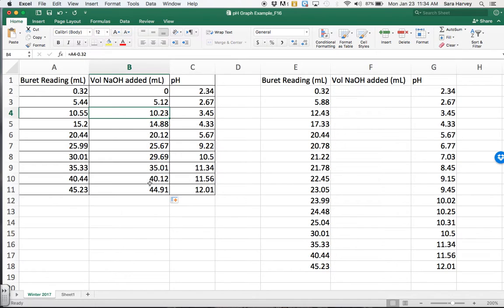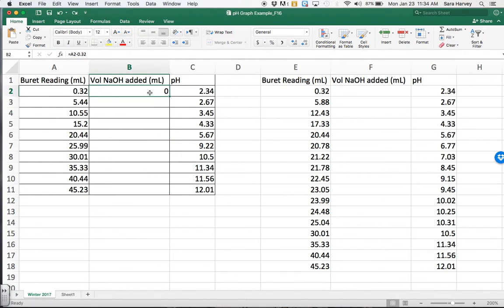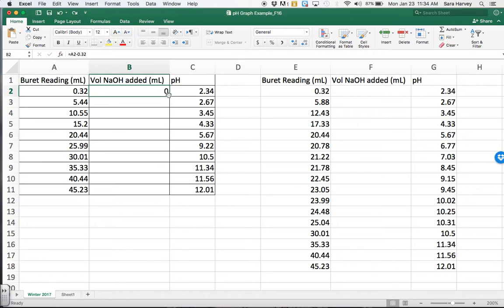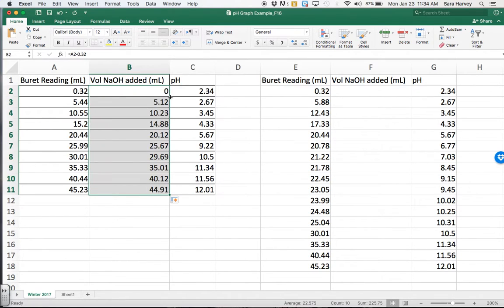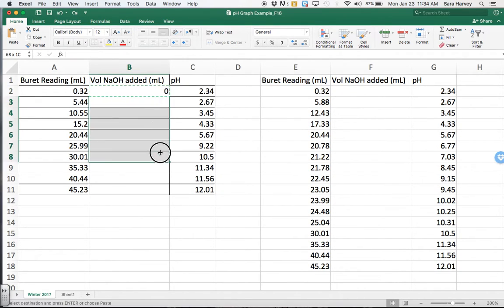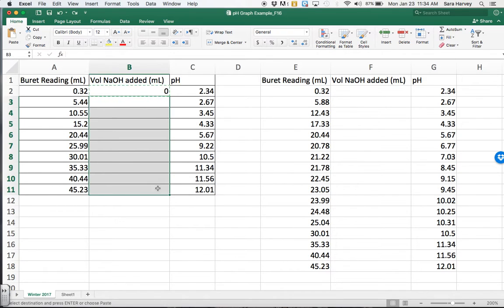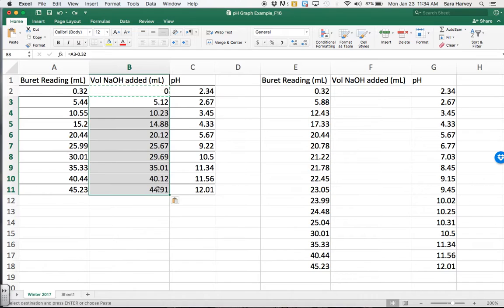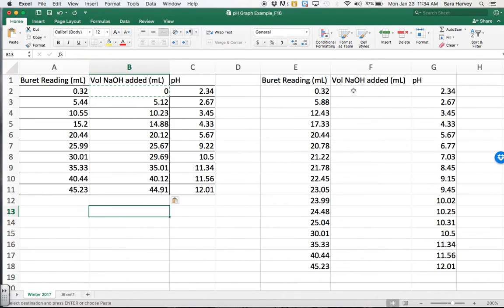So again, bottom right-hand corner, double click, it goes down. Another thing you can do, you can just copy, so on a Mac control C or command C, on a PC command C. On a Mac, and then paste, that works.